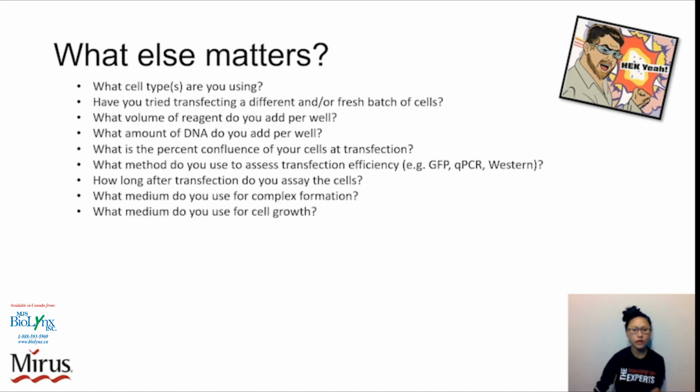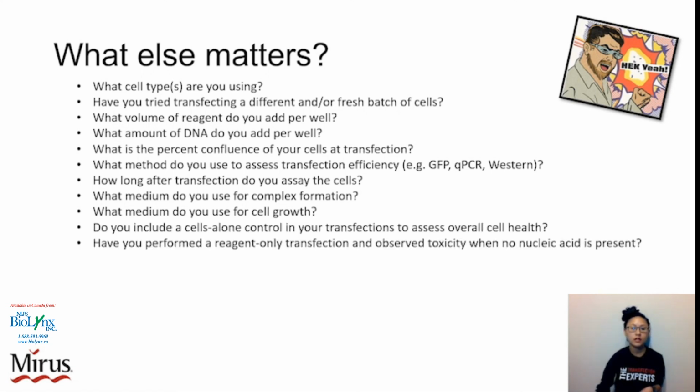What medium do you use for cell growth and complex formation? We touched on this, but you don't want strange additives in the medium that might interfere with the formation of those complexes. Have you performed a cells alone or a reagent only transfection? These controls are particularly important to identify where cytotoxicity is coming from.